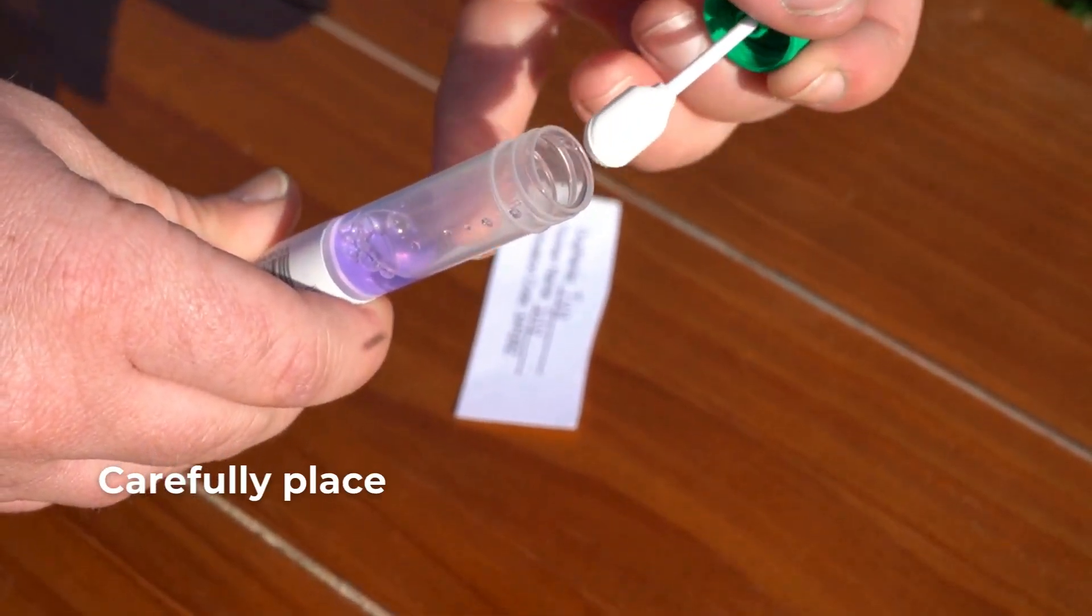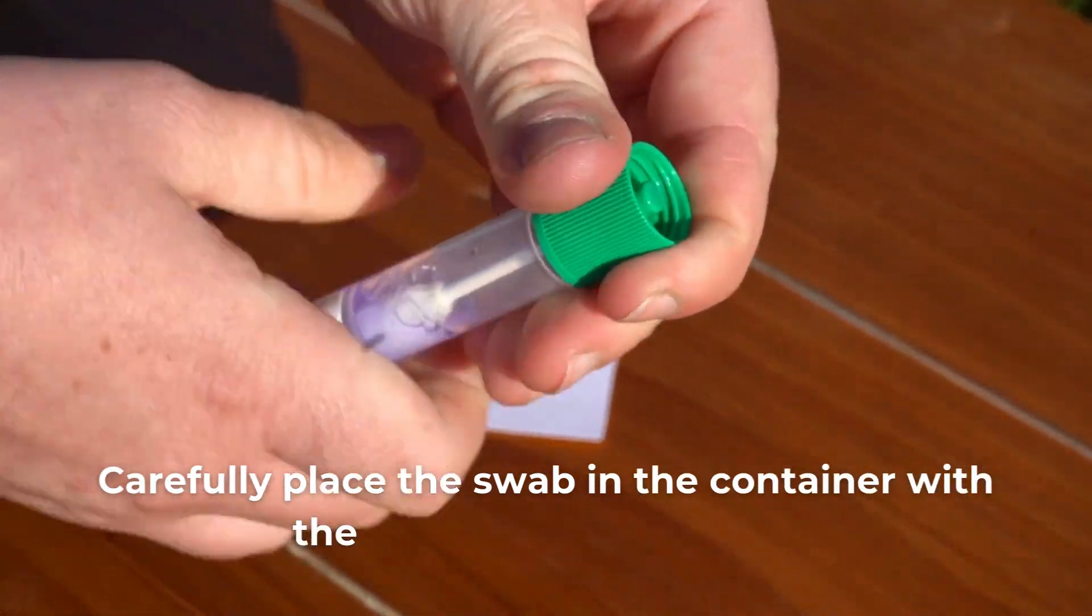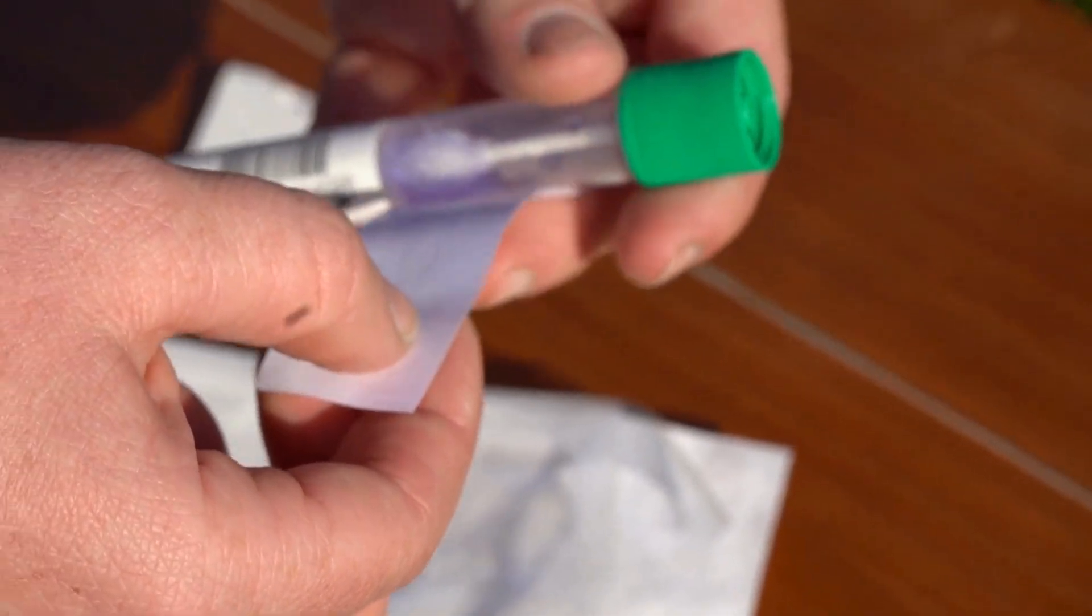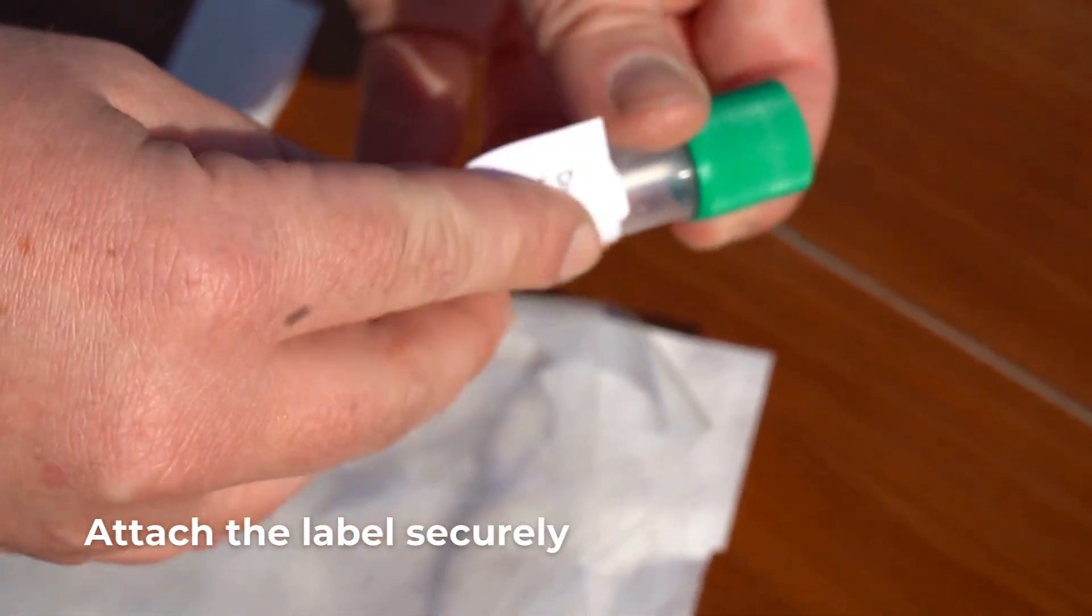Carefully place the swab in the container with the liquid and tightly sealed. Attach the label securely to the collection tube.